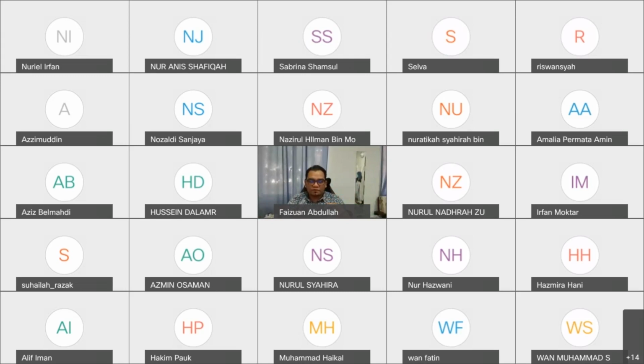So we have two types of analysis using the spectroscopy method. It is based on light, absorption or emission of energy in the form of light. Okay, that is the basic thing about spectroscopy.